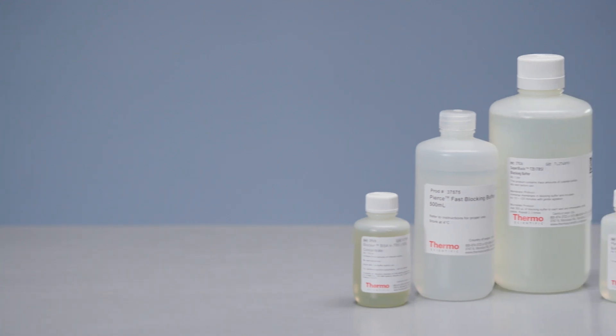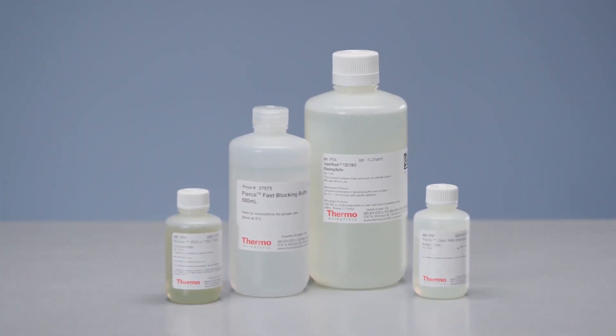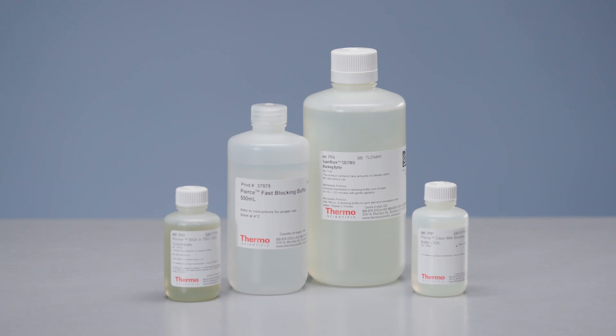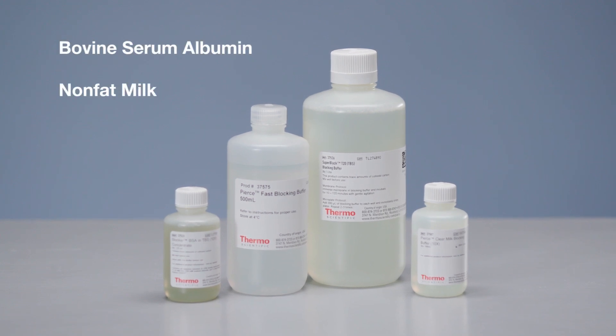Blocking buffers are often comprised of tris or phosphate-buffered saline with tween-20 detergent in up to 5% of a non-reactive protein, such as bovine serum albumin, non-fat milk, casein, or gelatin.